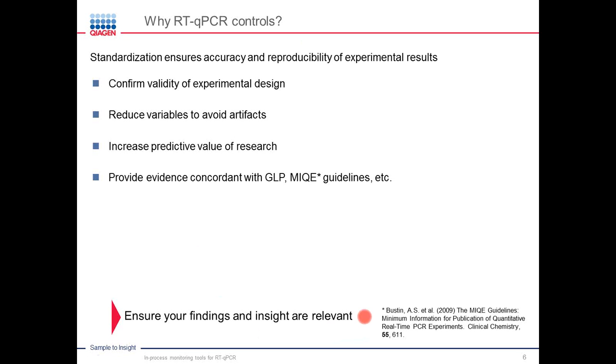And for that reason, we are incorporating controls into the procedures to improve the standardization of our process, to make sure the accuracy and reproducibility of the experiments is great, to confirm the validity of what we are doing, to reduce any type of variations or variables that would result potentially in artifacts of our experiments, to increase definitely the predictive value of what we are doing, and also to be in line and synchronized with guidelines like good laboratory practice, or I've been specifically mentioning here the MIQE guidelines.